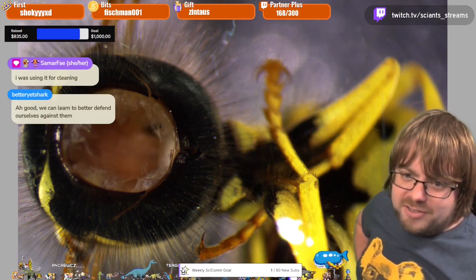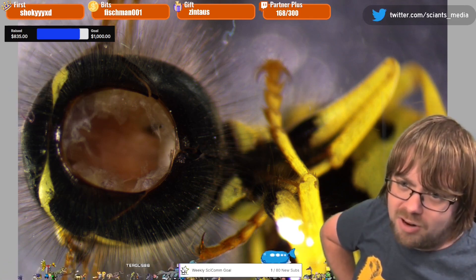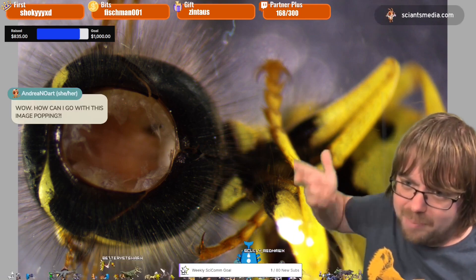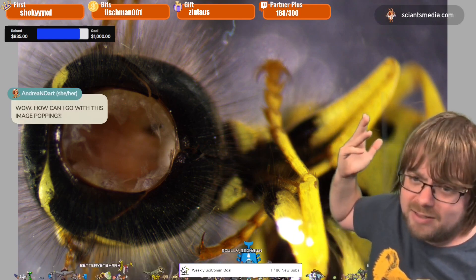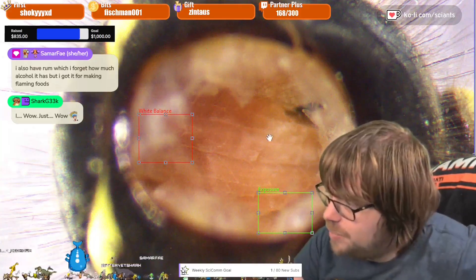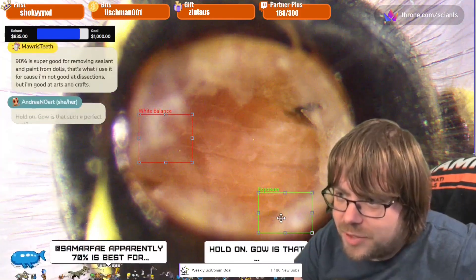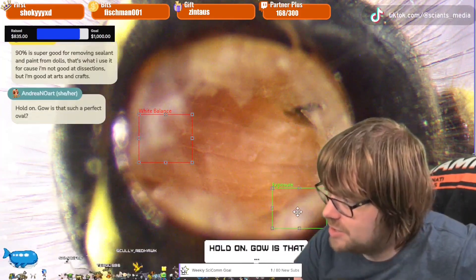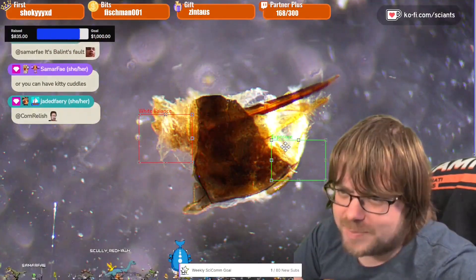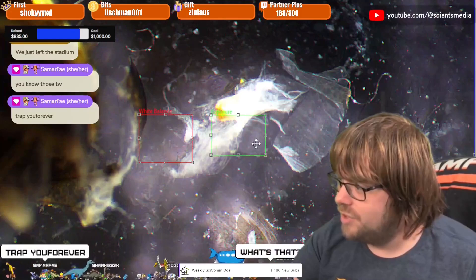Let's go look at the abdomen now. Here are the innards of a wasp thorax. Do you see that fluffy bit? Those are muscle tissue - strips of muscle tissue right there. We popped off the head, that's all I did, and you can see inside of it now. You can see how it's strips of tissue - that's what you're seeing.